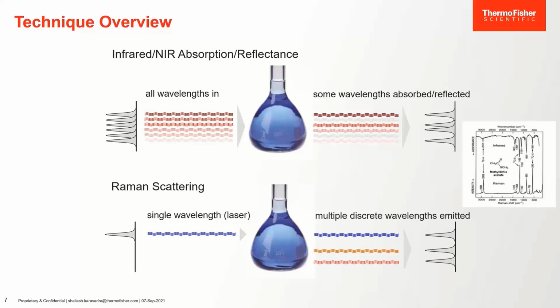Then you have the attenuated total reflection, or ATR technique, which has now become a standard. But there are certain pros and cons to it. One is that it has to have very good sample contact, and you can use various kinds of crystals with it: germanium, diamond, zinc selenide, and that depends on the spectral range that you want, penetration depth, and robustness. You have specular reflection and also diffuse reflectance.